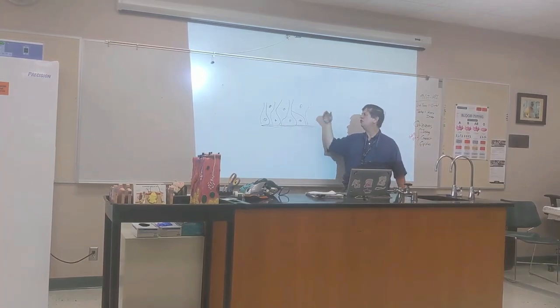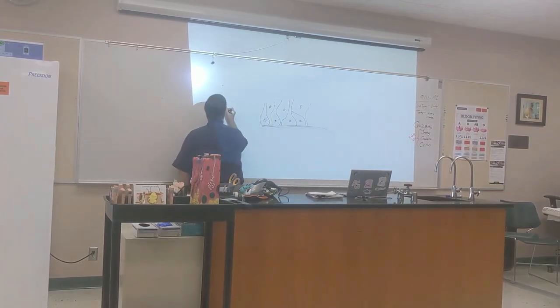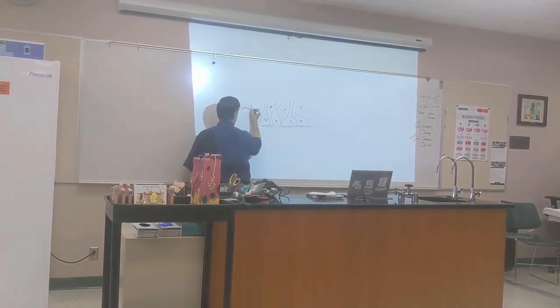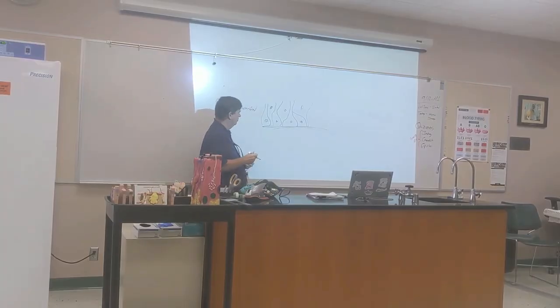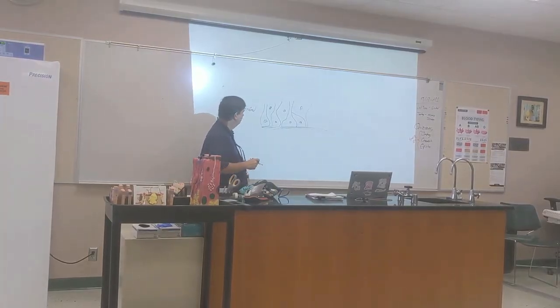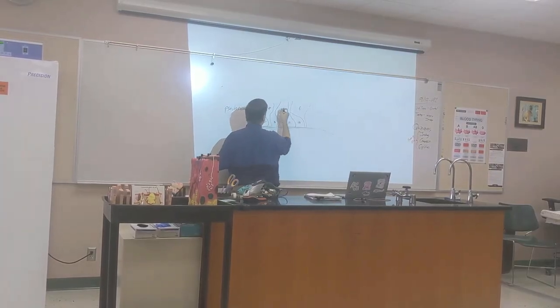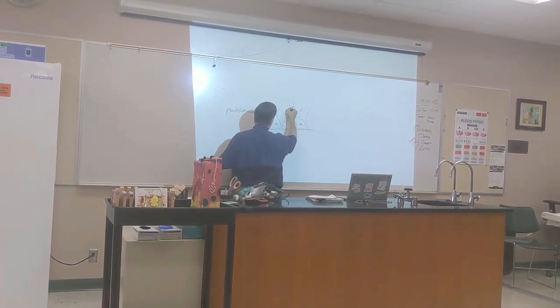But because it looks stratified, we have a special name for it. We're going to call it pseudostratified. In fact, because they're tall, you could maybe say pseudostratified columnar. In fact, let's change one of these because it looks so much like it. Let's say this is light staining. I probably should have used black. That has a bunch of granules in it.